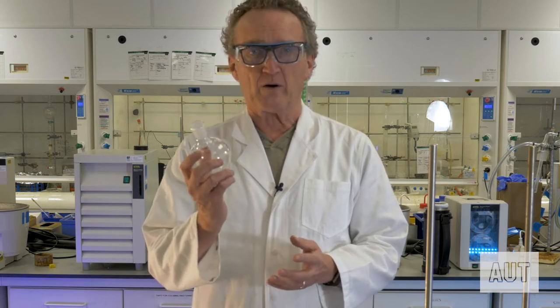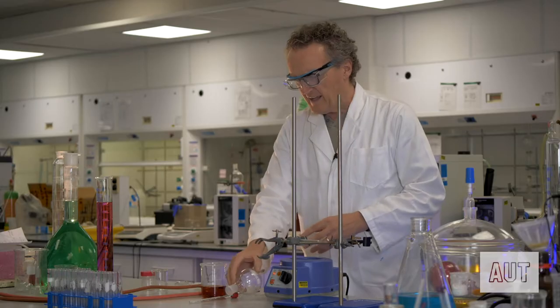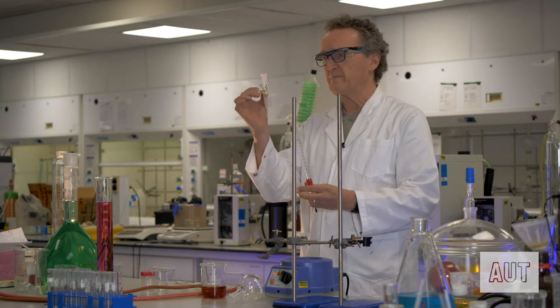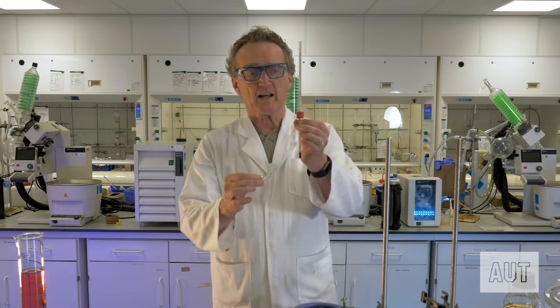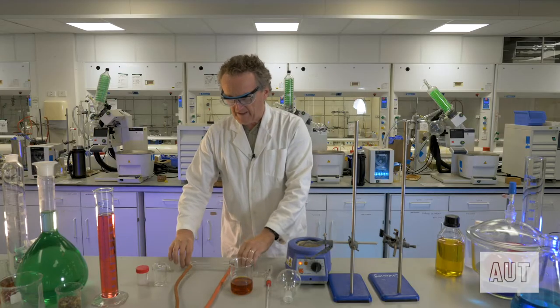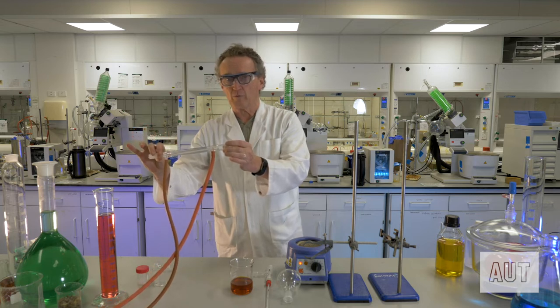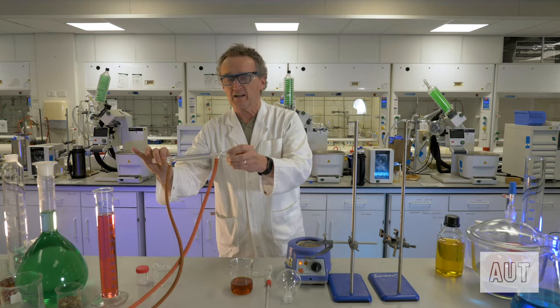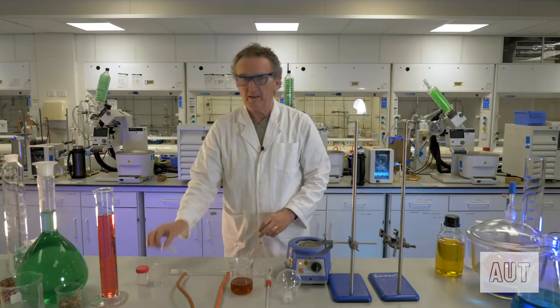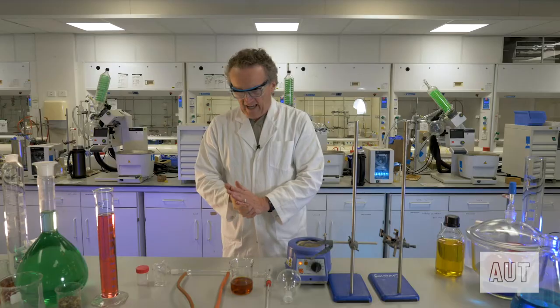Okay, first and foremost, we've got our round bottom flask. That is what we are going to put our liquid to be distilled in. And then we have a thing called a still head here. Into the still head, we are going to put a thermometer, complete with a thermometer adapter that just sits in there. We have then a condenser. This is the condenser, and this has cold water running through it. It's a double jacketed arrangement. You'll be able to have a look at one by yourself when you are doing this in the lab. We have a receiver adapter here, and that goes on the end of the condenser. And that's pretty much all the gear.